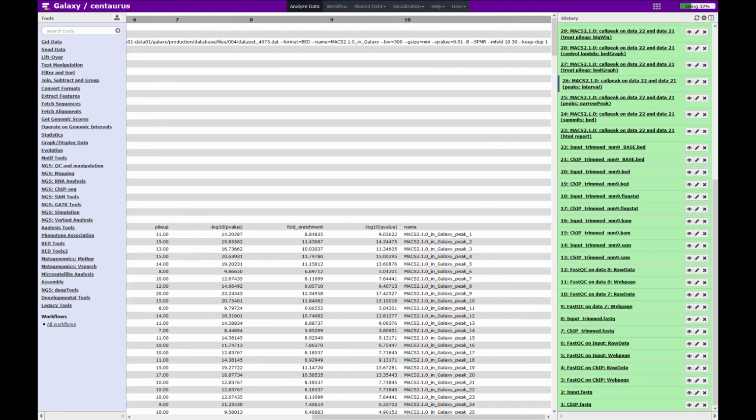When sorting the file, I sort by p-value, not q-value, but I use the q-value as the threshold statistic. The reason I sort by p-value is these tend to be discrete values, where you'll sometimes see that the q-value steps so that you get the same value, and this isn't good when you're sorting. So sort by p-value.